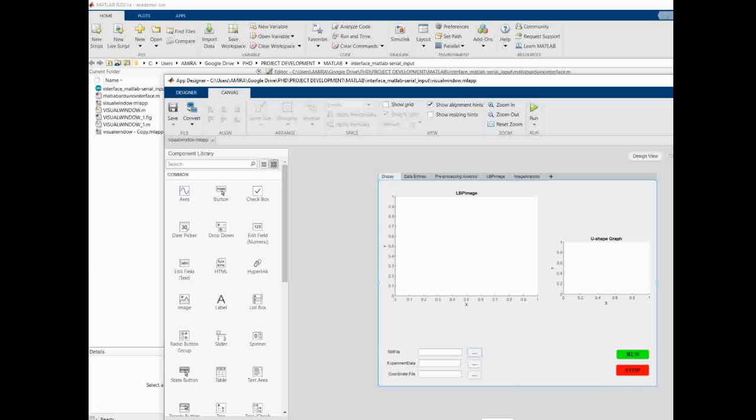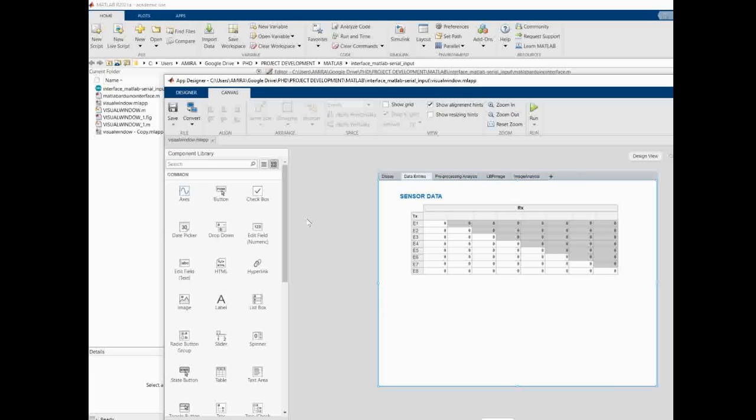I have this here because this one is a constant value, so I've given options to load the data from the computer to the MATLAB. I don't know yet how to do it, but I will figure it out later. This is just a design, and of course the run and stop buttons, where when I press the run button, it will initiate the transmitting and receiving of the electrodes. So this is just a go through of what the platform will look like.